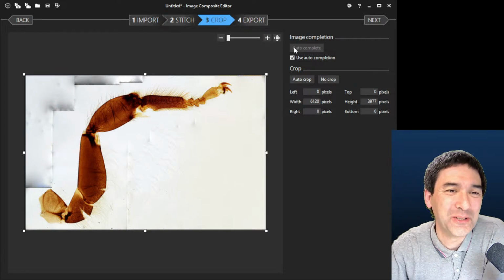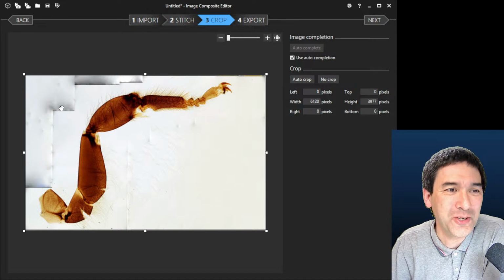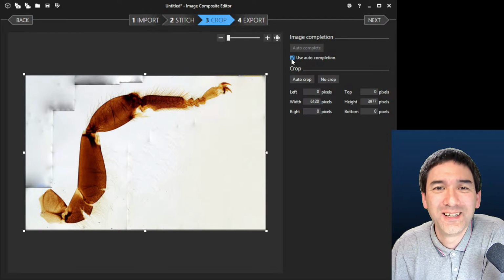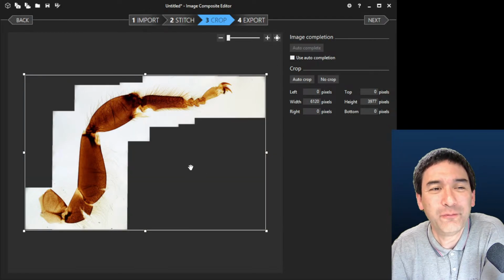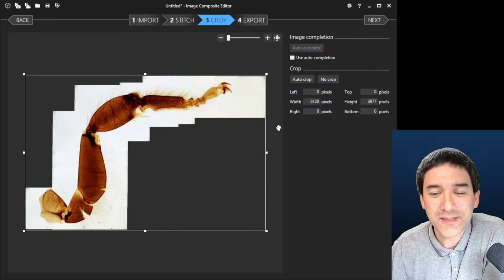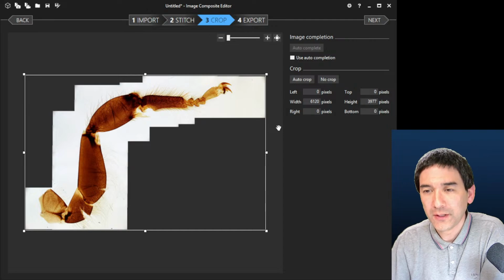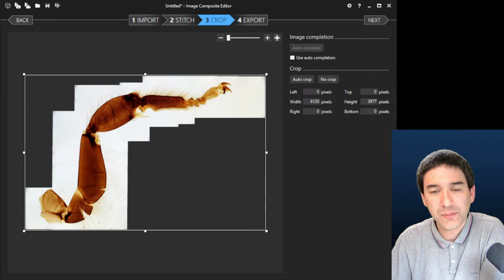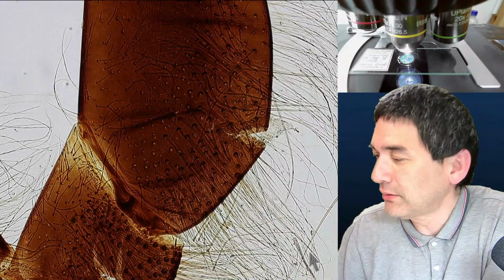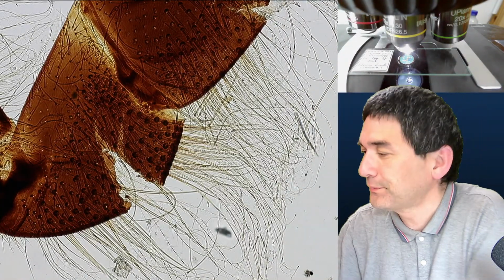So it's not perfect, but you see all of this strange stuff here, right? But that's actually interesting. So let's do it away. But I think in Photoshop you can easily fill it in. So let's try another one. I think I have one more left here. Let's have a look. It always takes me some time to click around here. Okay, let's remove the arrow. Click.